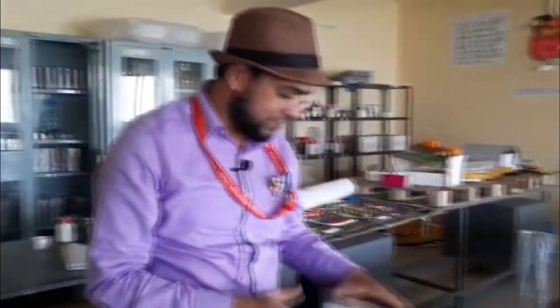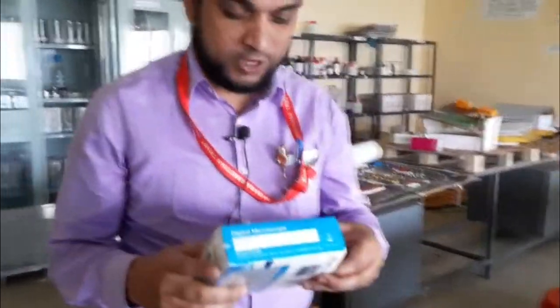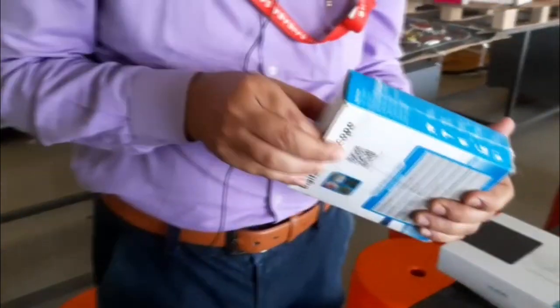I'm Professor Movin Shake, and I'm going to explain and unbox the digital microscope first. I will review how this product is useful for you. I bought it today, and this is how you take it out.